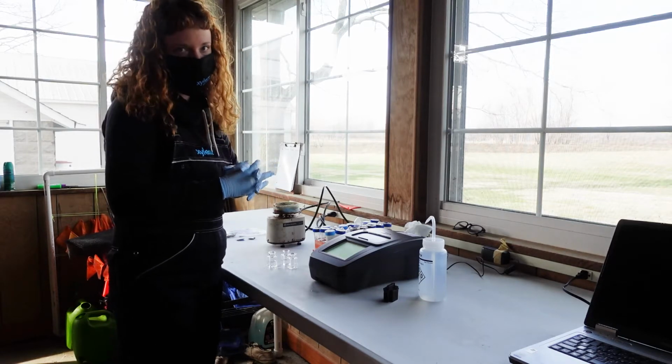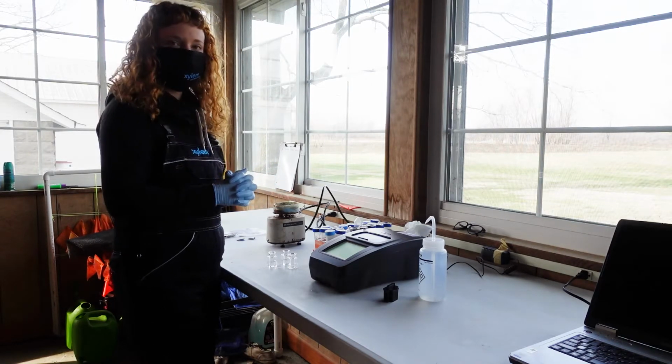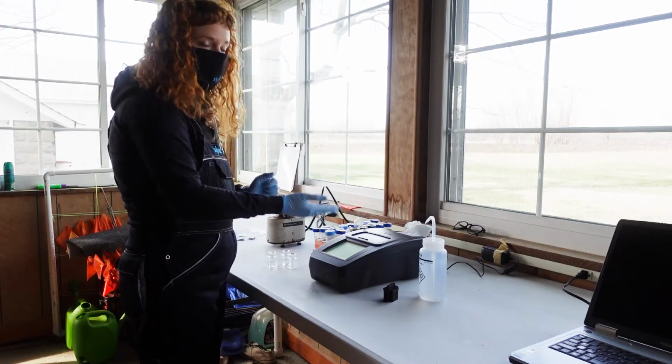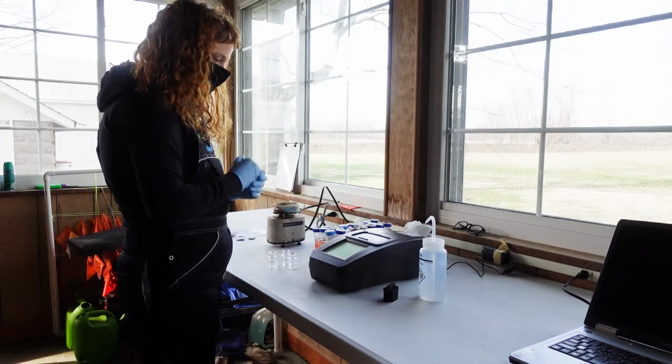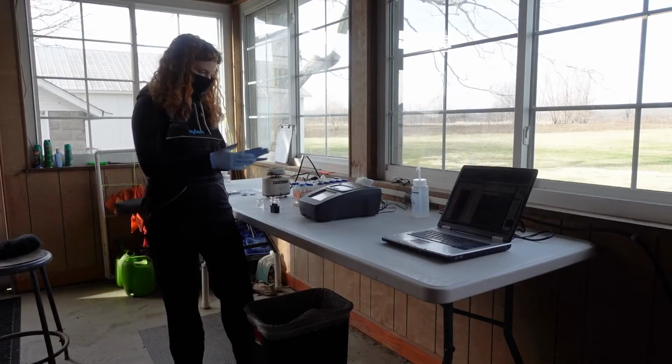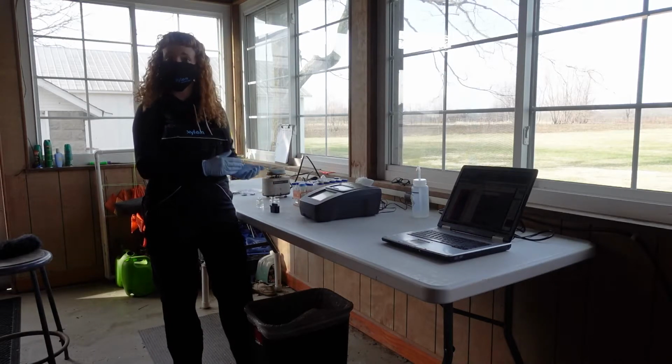So the instrument will take a couple seconds to read. And I've gotten some results. I've gotten 2 measurements at the 2 wavelengths, and then we'll show you how you will put those into the spreadsheet. So you've gotten your sample measurement. It's time to measure your next sample.